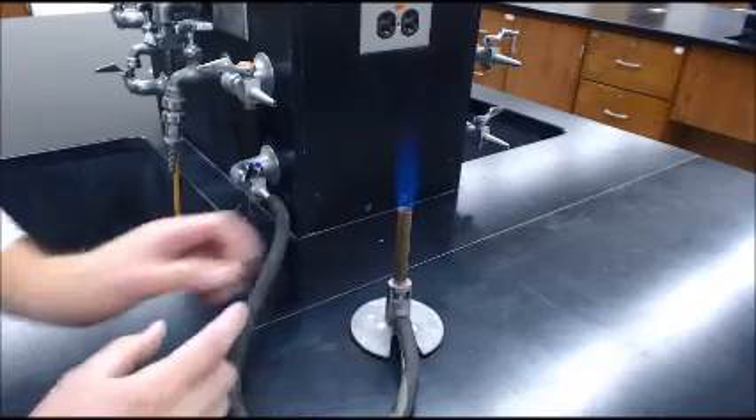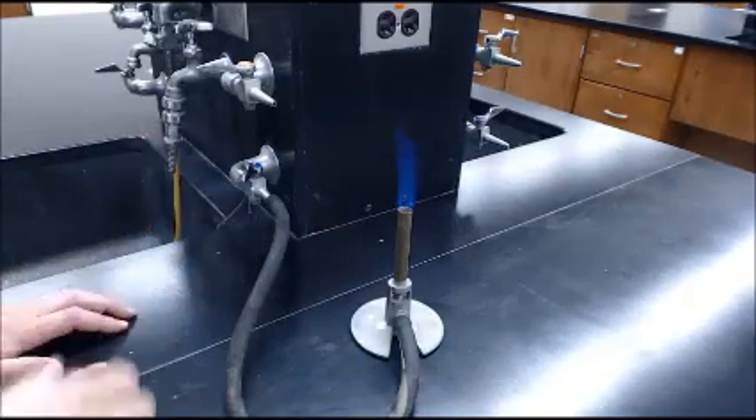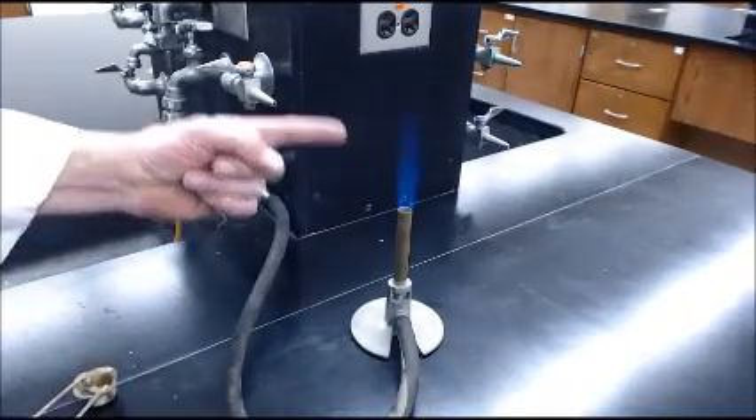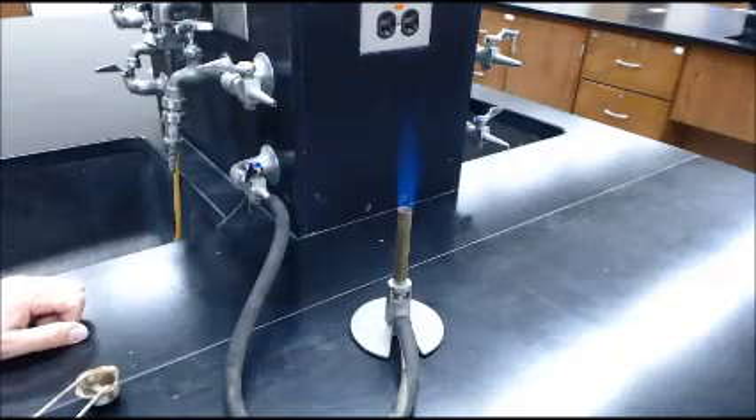Eventually, you should start to see when it gets very hot, it almost looks like there are two flames — an inner cone and a larger flame. The inner cone, the tip of it, is the hottest part of the flame.